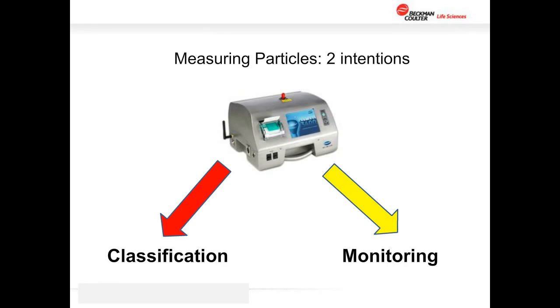That is something where you're testing more frequently, often on a daily or even continuous basis. These are really 2 quite different applications, but often using exactly the same instrument. So hopefully, as we go through this discussion today, the appropriate use of the standard for classification versus other documents and procedures for monitoring will become a bit more distinct and clear.